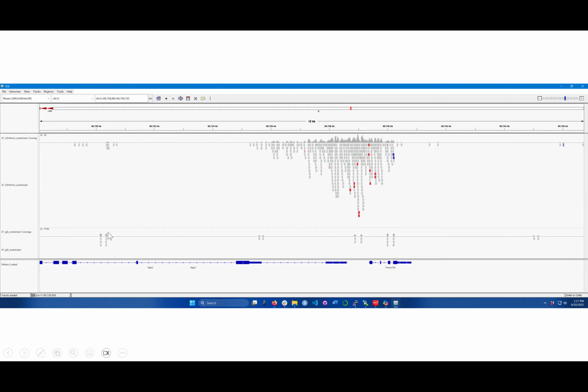And you can see here that there are some sequencing reads in this region for the IgG antibody, but they're not localized really to any particular location, and they don't seem to be accumulating at the promoter or anything. And they're much less intensity or coherence than we had for the histone mark.